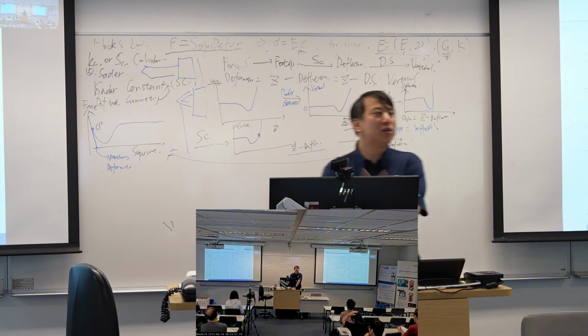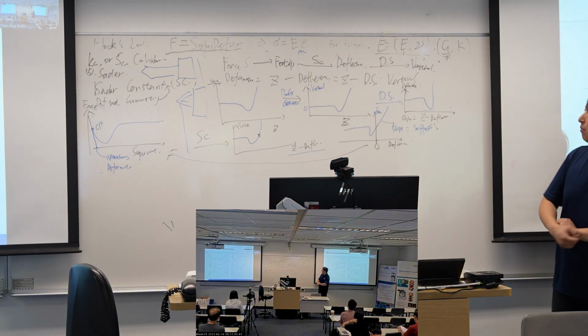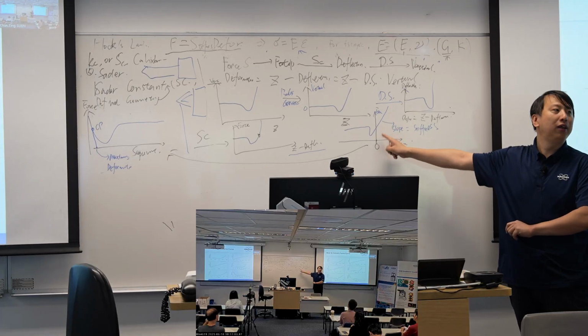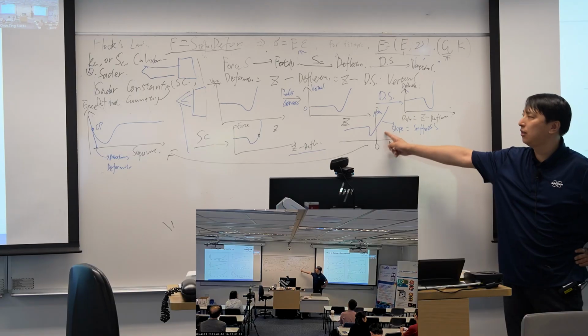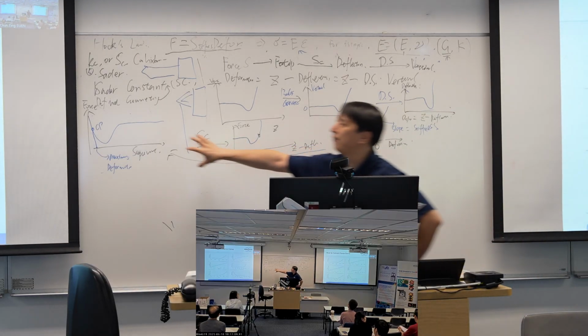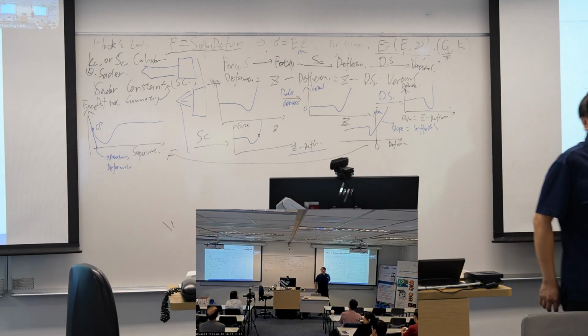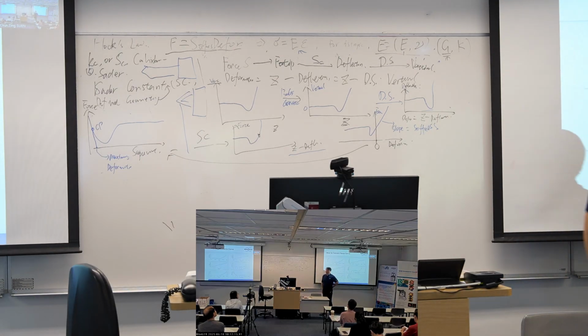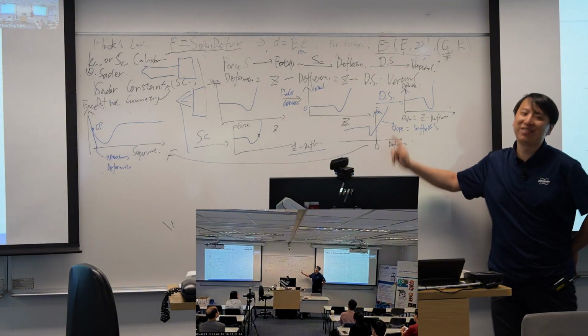Usually when you search for papers in the scientific literature, the final curve is something like that. Even on the nanoindenter, your final curve is like this, not like this one. Okay, so if you want to publish the paper and the reviewer asks you for typical force curves, yeah, please change it back to this.